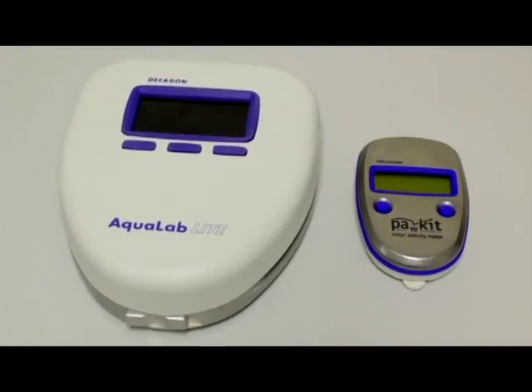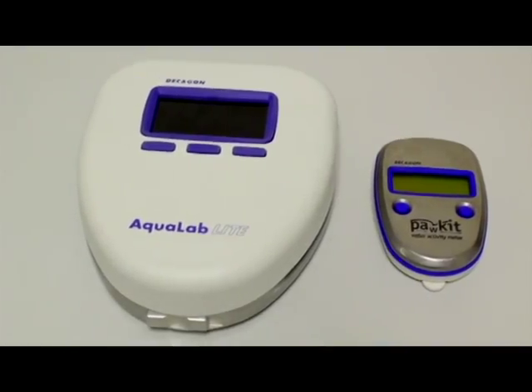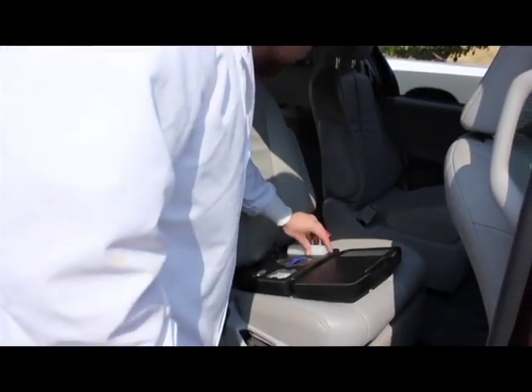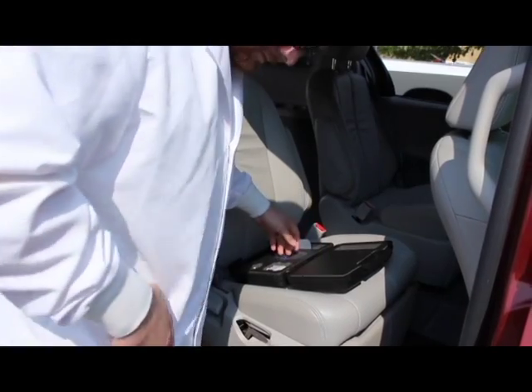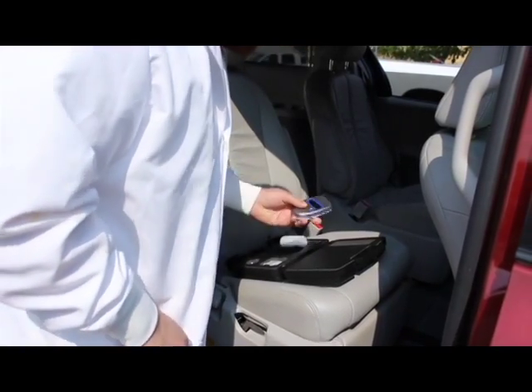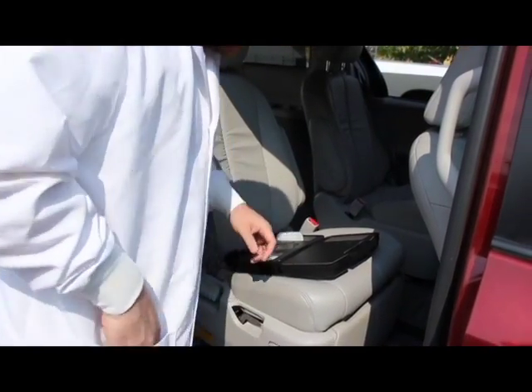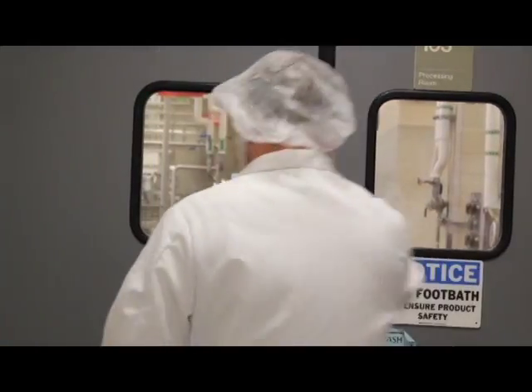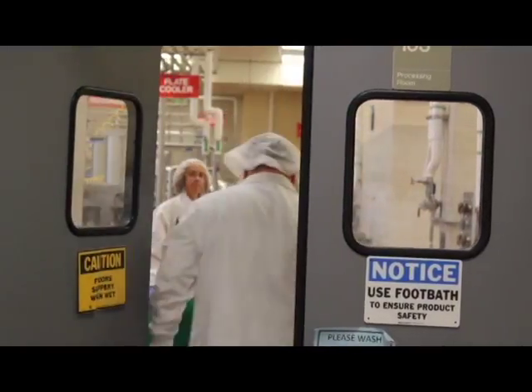This video will show you how to clean, use, and maintain the Aqualab pocket and light. Both the pocket and the light were designed to be portable water activity meters to get quick water activity readings. It is important to know that these instruments were not designed for use in a lab, quality control, or a research and development setting.